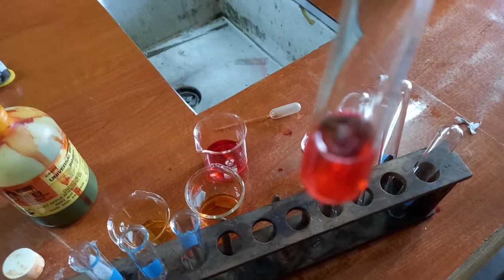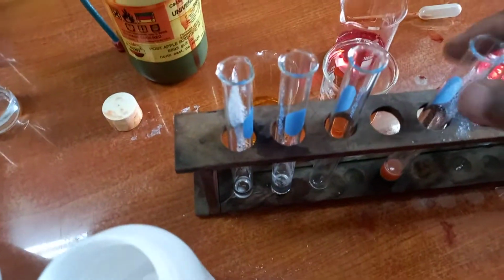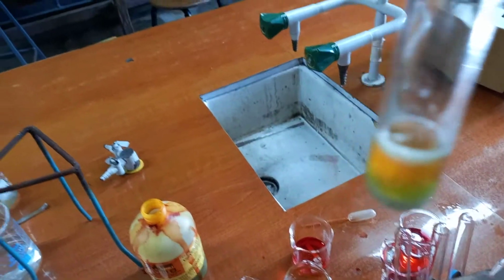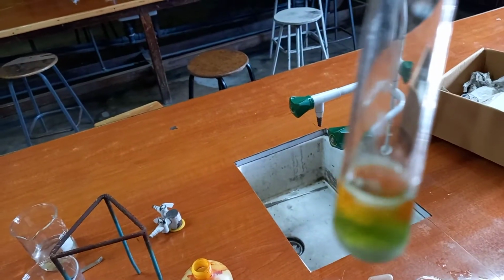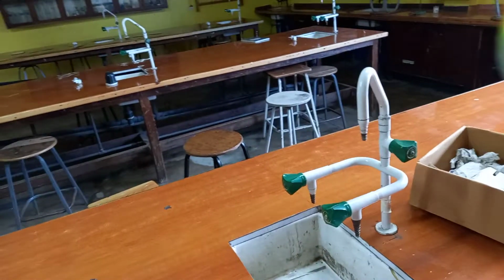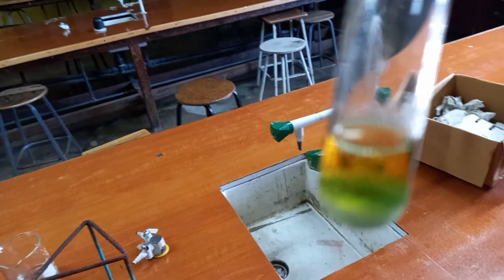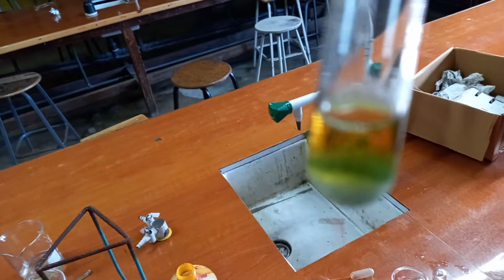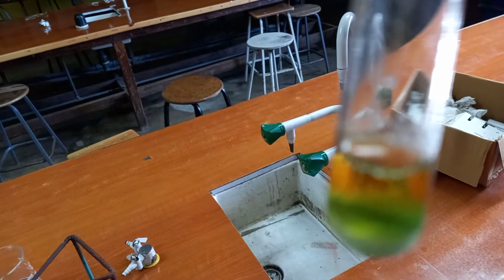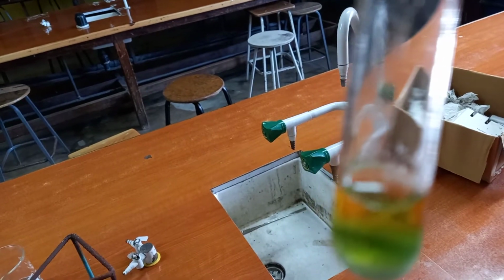Nothing. Alright, let me add a little more. Alright, here we go. Alright, so there we have that's orange and green. So we have the color change. Well, the universal indicator was in there, so the pH of the solution is changing. Hence you have the color change. But in terms of the reaction, you have a few bubbles being formed, right?